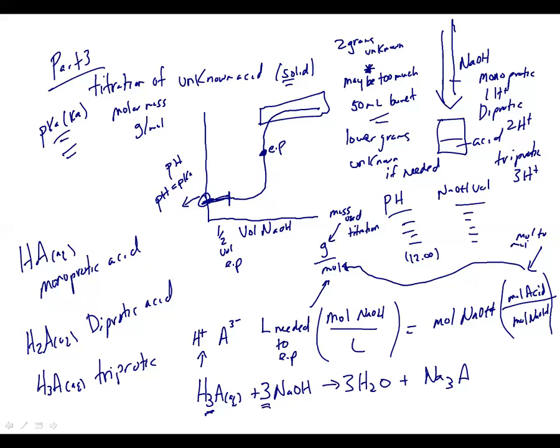You'll also see the data analysis, which will explain to you the calculations that you need to do. So when you're done with all these parts, make sure you've gone through all the data analysis, done everything they asked you to calculate, graph, and identify on the graphs, along with obviously the pre-lab and post-lab questions that will be there as well. Any questions on the titration experiment?